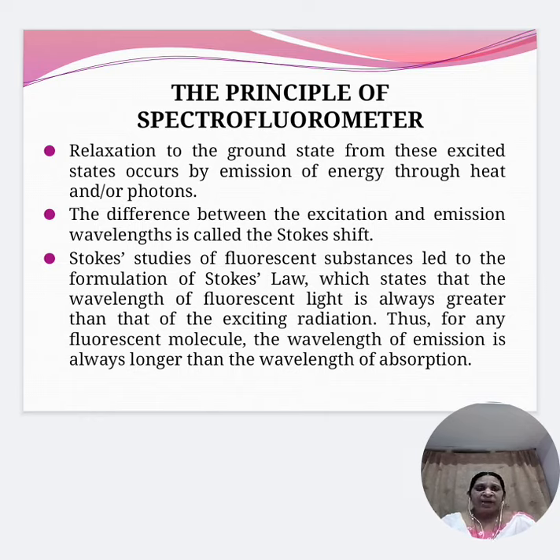So, when an electron of an atom or a molecule gets excited to a higher energy state, it once again comes back to its original state, thereby emitting energy through heat or photons. The difference between this excitation and emission wavelengths is called Stokes shift.